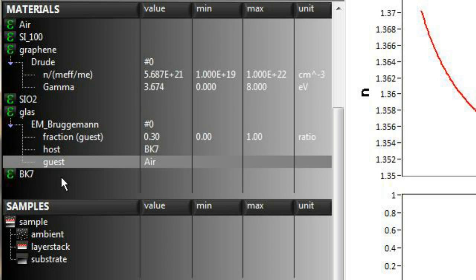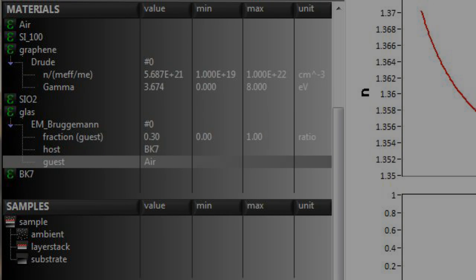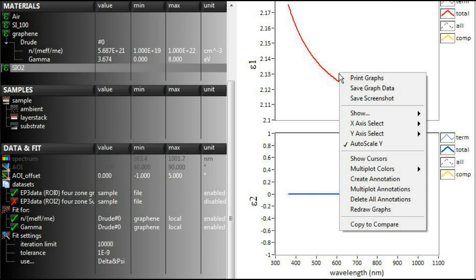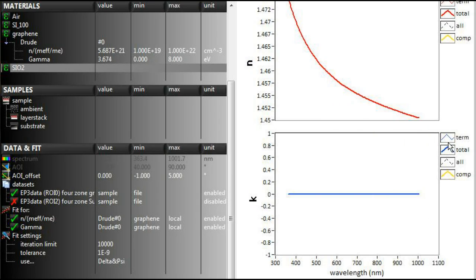Effective medium approaches may be used, for example, for rough layers or mixed layers. As a material is defined, its dispersion will be displayed as a function of epsilon 1 and 2, or as a function of n and k.